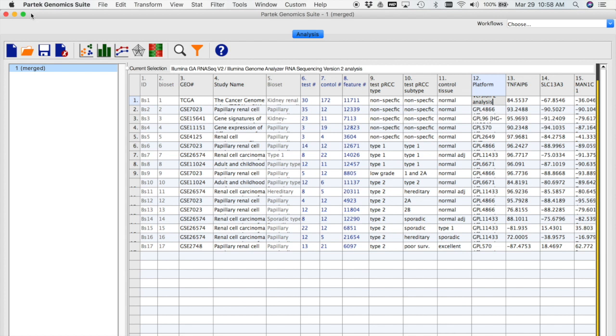In this installment, I use Partek Genomics Suite to display the metadata as a heat map and employ hierarchical clustering to find connected genes in a dataset based on its normalized gene scores across all 17 different comparisons.